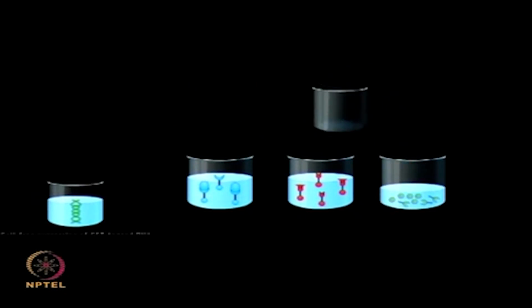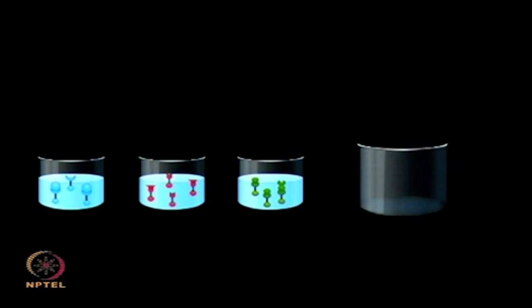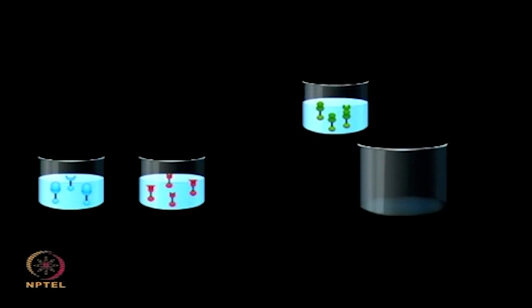Once the cell-free expression step was completed, the synthesized proteins were further immobilized onto the beads through the capturing agents. These beads were then mixed together.